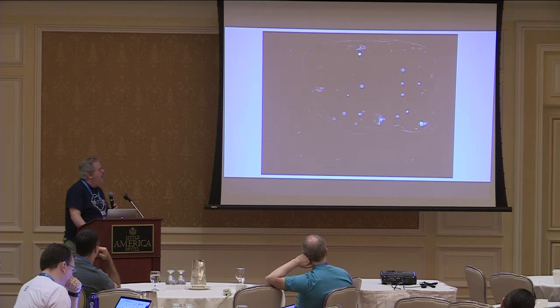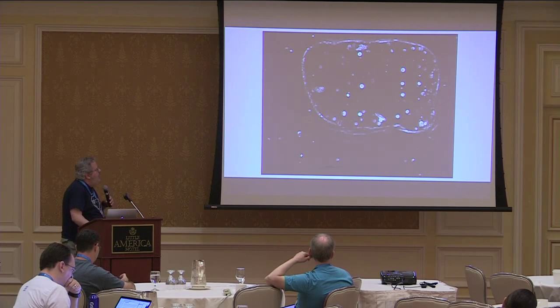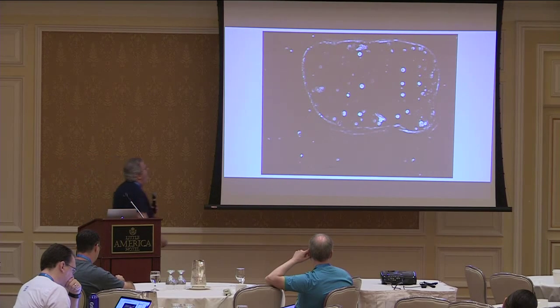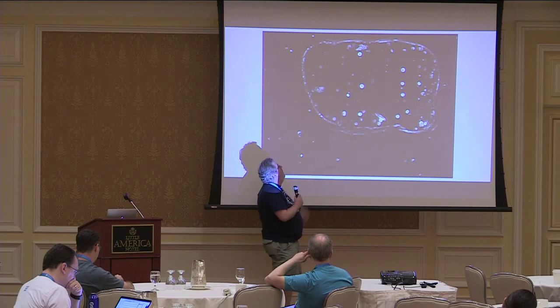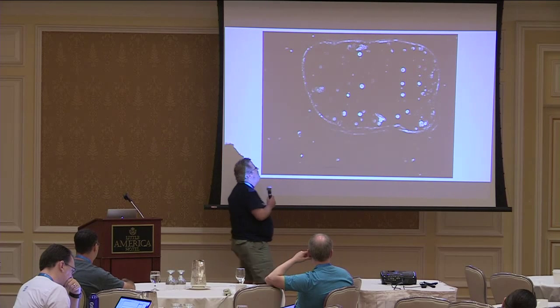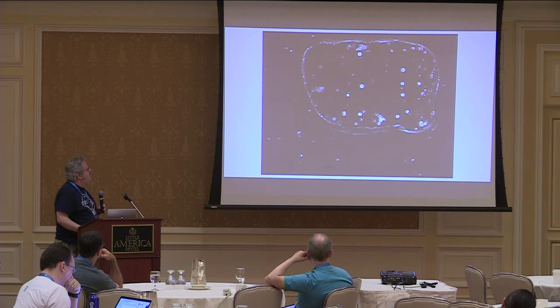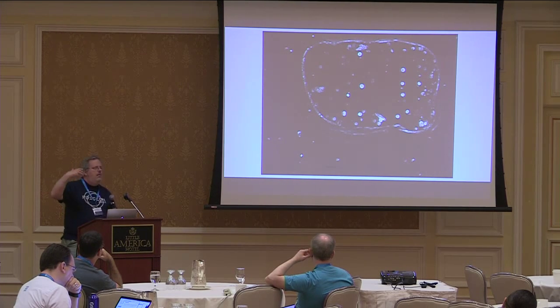So this is our image after we subtracted the mask off. This is what we get after we do the morphological image gradient. You can see that all the cells are lit up pretty well now, but unfortunately we have some of that mask, the wall, back, that we thought we had erased in that previous step. But we can still deal with that. So the next thing to do after that is to run something called Otsu thresholding. What Otsu thresholding does is it tries to separate the foreground from the background.